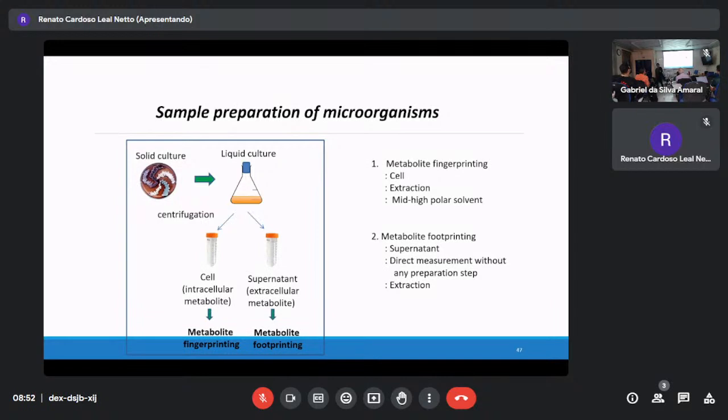That is the solid culture. But what is the problem with liquid culture? You are growing microbes in the liquid. It's a media, and then there is the cell mass. You filter the cell mass, then you crush it and extract it. No problem, it's just the same. You can treat it like a solid material, right?